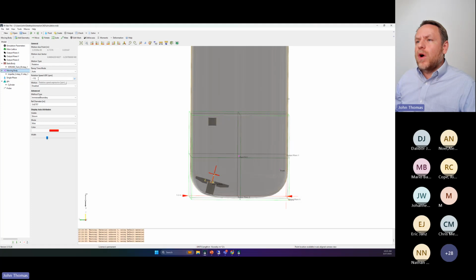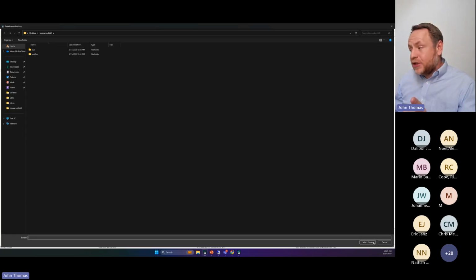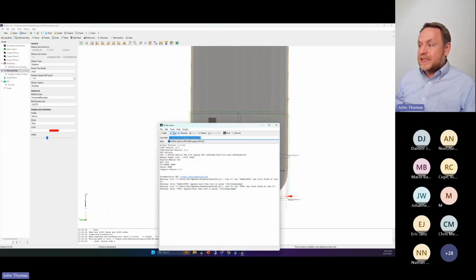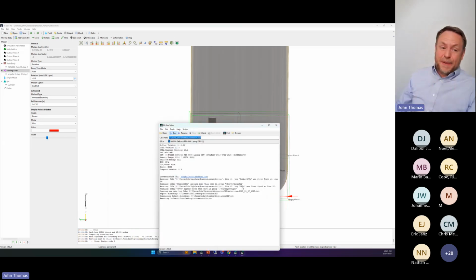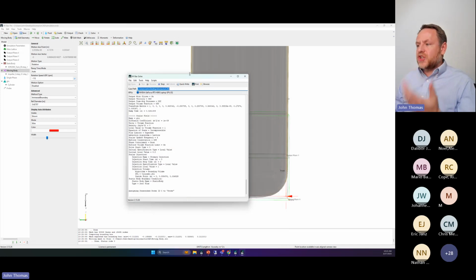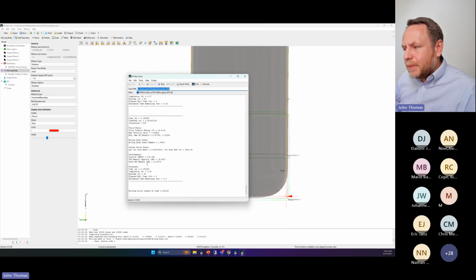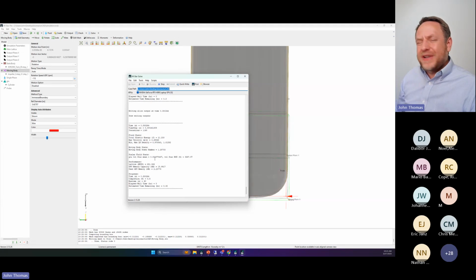And again, with the same impeller speed, I'll go ahead and run this. But now I do not have a free surface because, as I saw from previous runs, I'm not going to need it. There's no vortex, and no sloshing. I could have anticipated that initially, but in this case, I just wanted to show the speed that comes with it. Okay, so here I'm running a little bit faster, but I did add more physics.